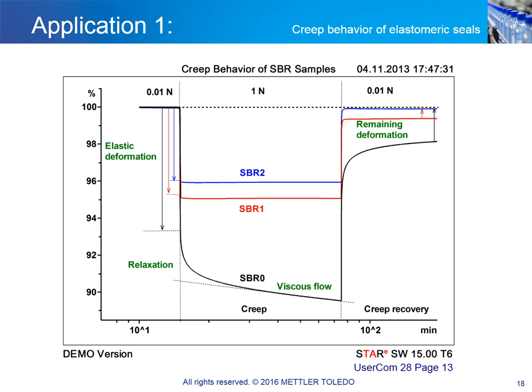sample. An important quality control parameter for gaskets or other elastomeric products is their deformation under the influence of an applied stress and their return to their original shape upon the removal of that stress. If the material flows under stress, it might not be a suitable seal between joints, and leakage could occur. The flow behavior can easily be measured with TMA or thermomechanical analysis.